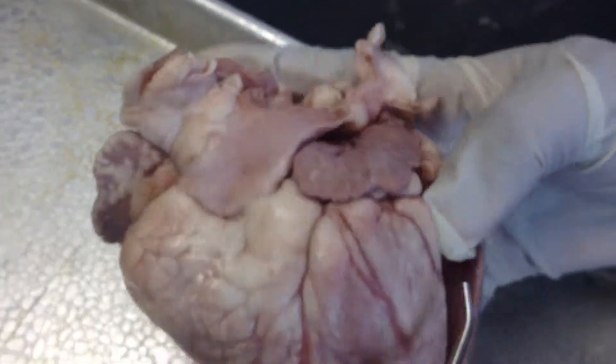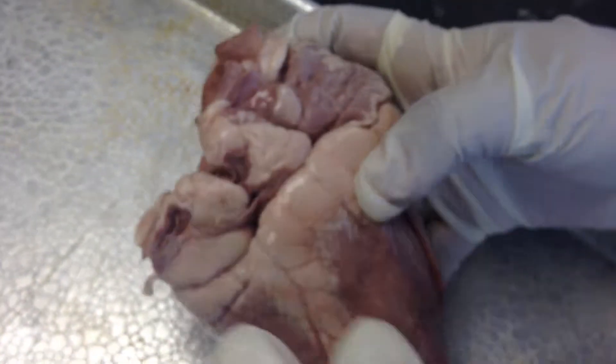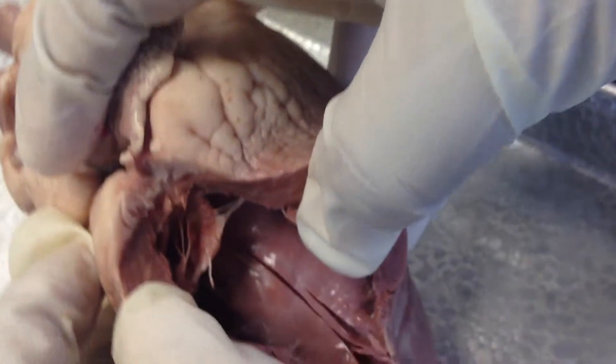If you turn it around, this is the right ventricle, and if you open it up there are tricuspid valves in here.